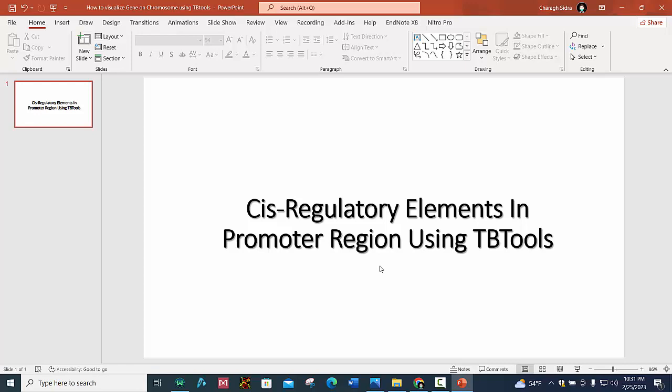Okay, so we will see how we can represent cis-regulatory elements in promoter region using TBtools.